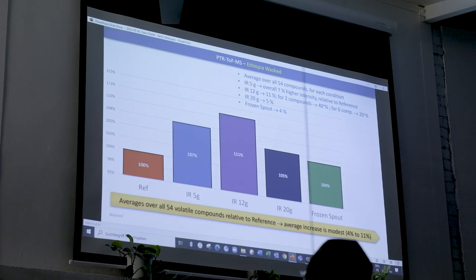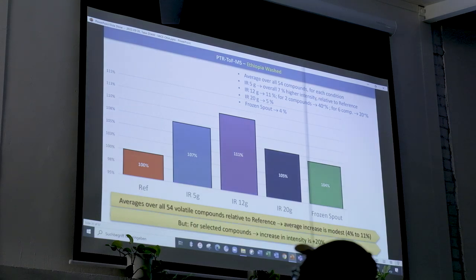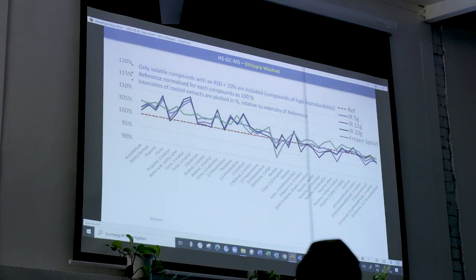Here we use another technique, which is a little bit less sensitive, but which is also used a lot, and we know exactly which compounds this is. What you see here, the compounds early on in this chromatogram, as we call it, are the more volatile compounds. If you go to longer times, the compounds become less and less volatile.